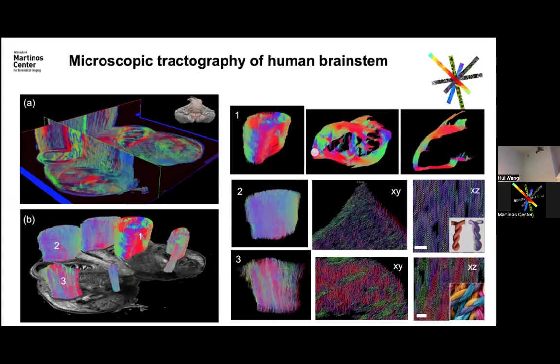But it doesn't seem that any of those tracks have any of this. Yeah, because this is immediately this structure right here, whereas the other two are from the spinal cord and go to really different brain regions in the cerebrum. So I assume they go together and travel to their destination. I don't know, all this warrants further validation and investigation, but this is the observation.